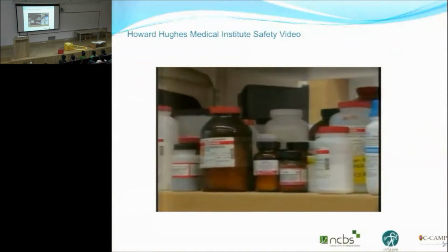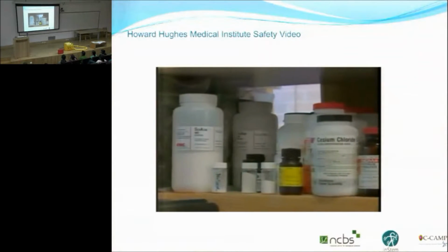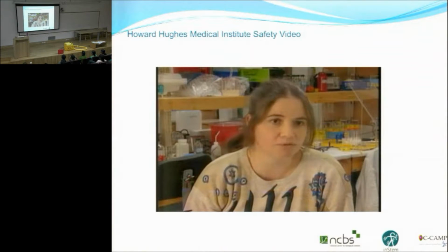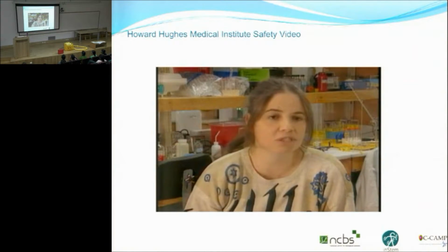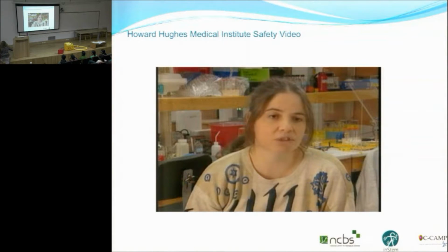You know, people who start in the lab have the tendency of being extremely concerned with radioactivity. This is really what they are scared of. Phenol and acids and all that, they are not too concerned about because we know exactly what happens if you pour acid on your hand. But I tend to think that these are actually much more dangerous for the kind of research that we do, where we use low levels of radioactivity most of the time. And that these are the accidents one should really watch for, actually.